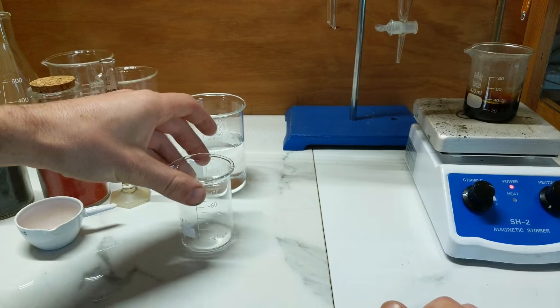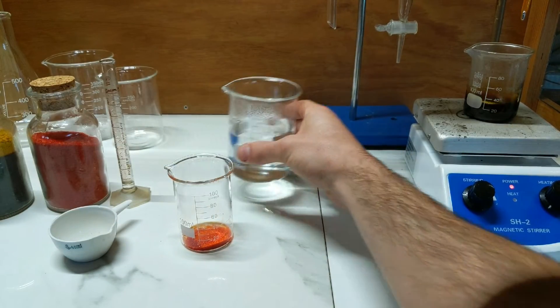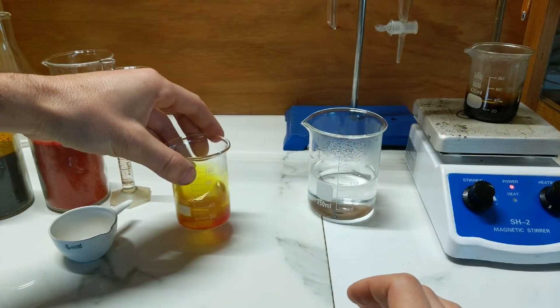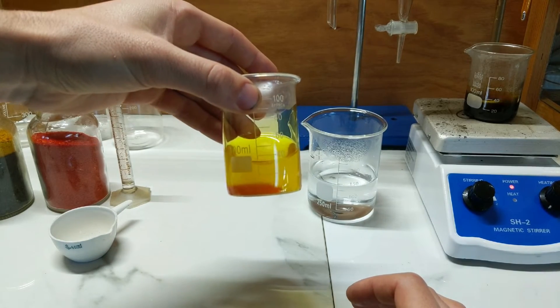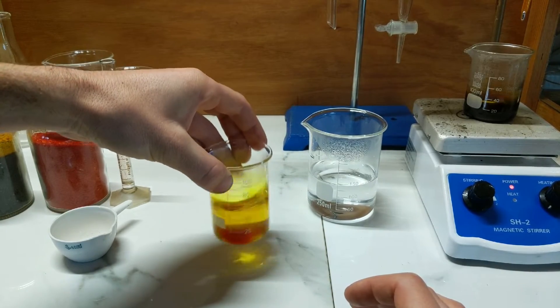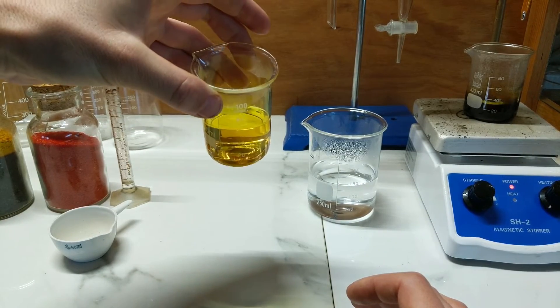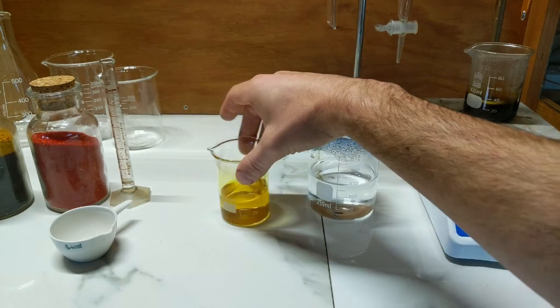While that's going on, we'll dissolve the potassium ferricyanide into 50 mils of 60-degree water and stir again, just looking for all the crystals to dissolve into a nice solution — which you can see there, done very simply.